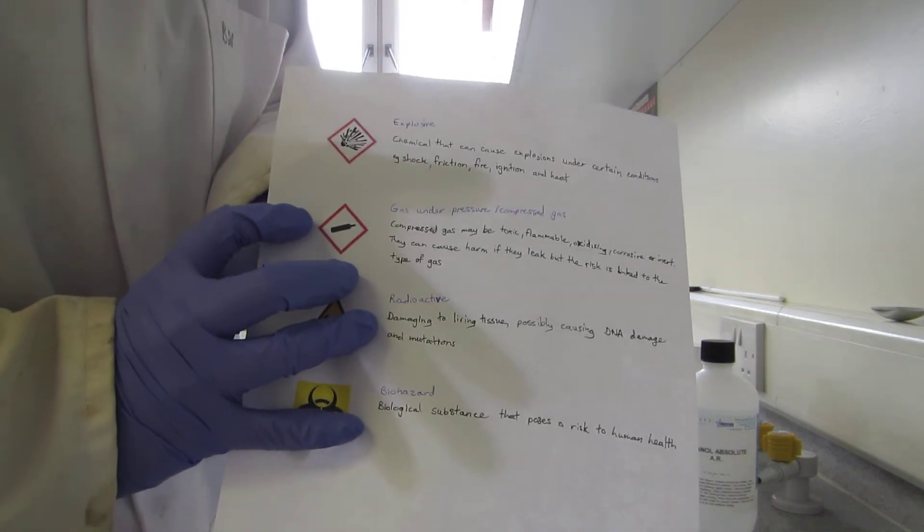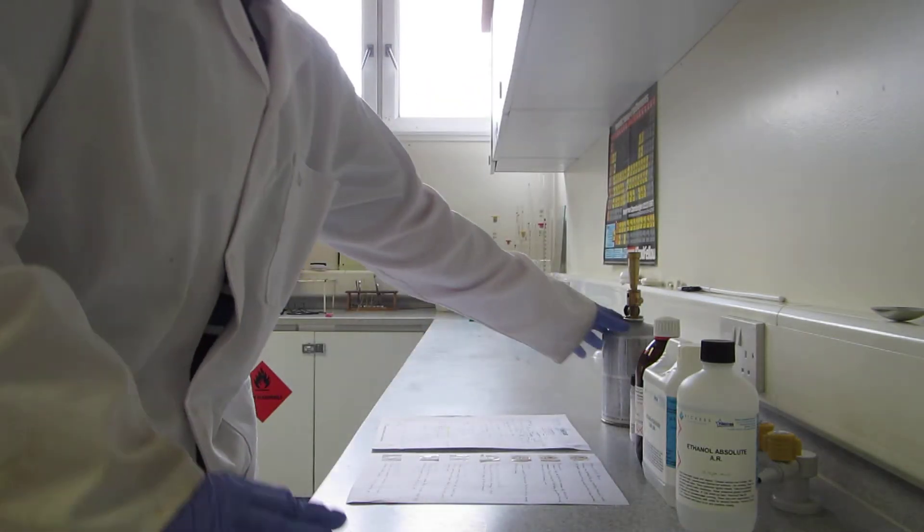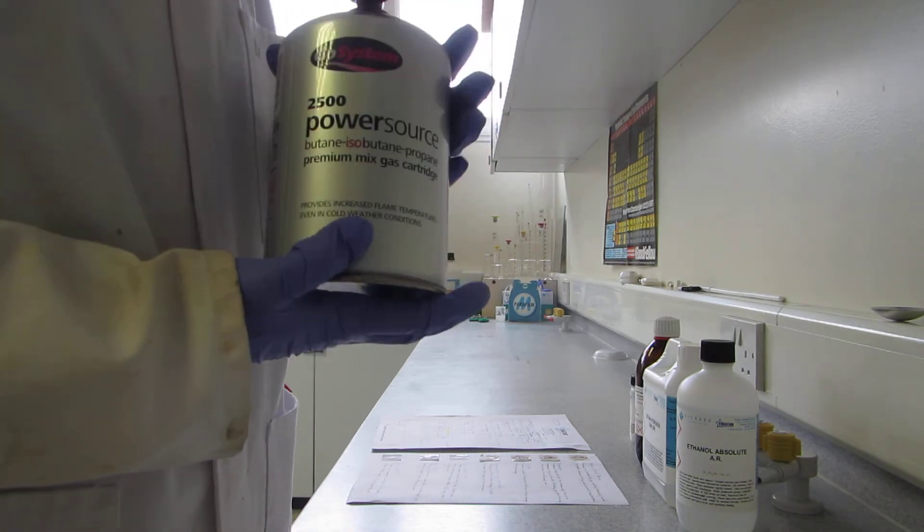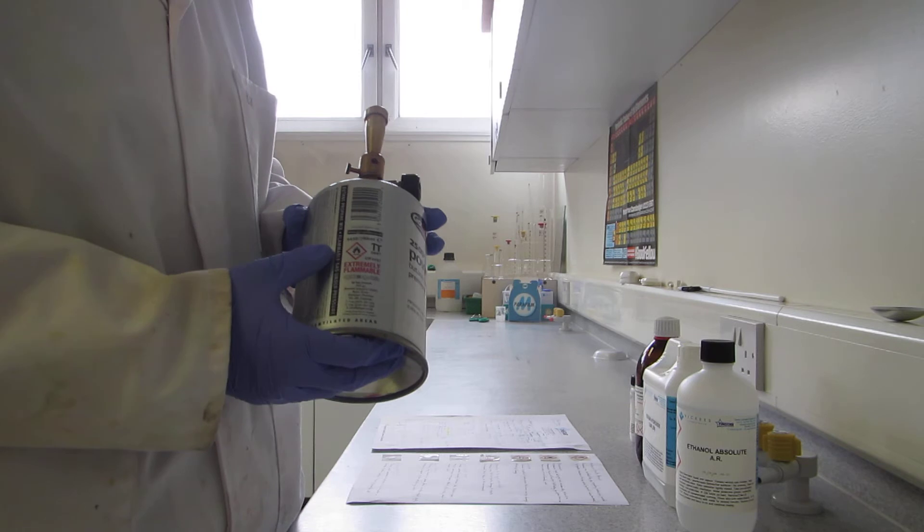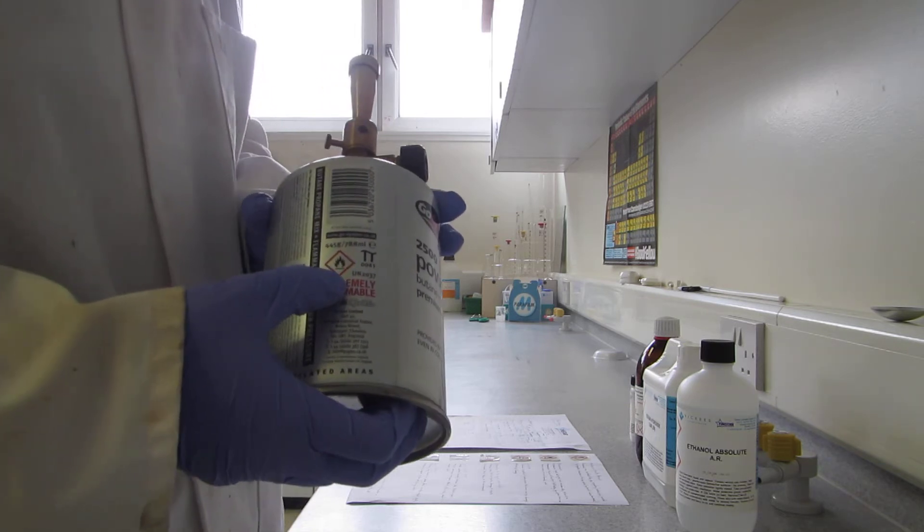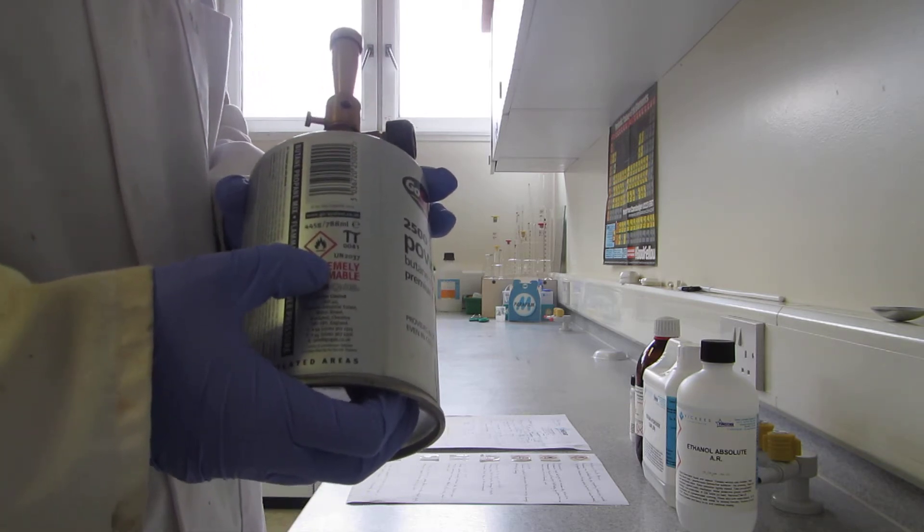You can also have the symbol for a compressed gas cylinder. I have a butane gas cylinder here for a portable Bunsen burner. It doesn't actually carry the compressed gas symbol, but it does have a flammable symbol.